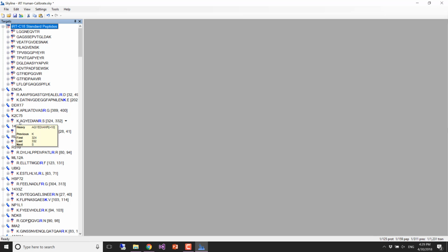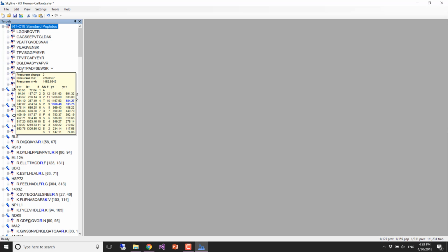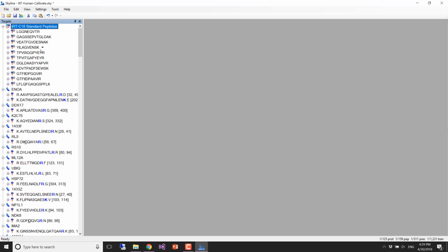Right here, you can see those little teeny circles with hands in them. They're supposed to be clocks. So if you don't see those, then something's wrong. All right, so yeah.